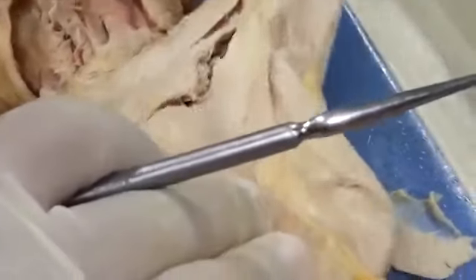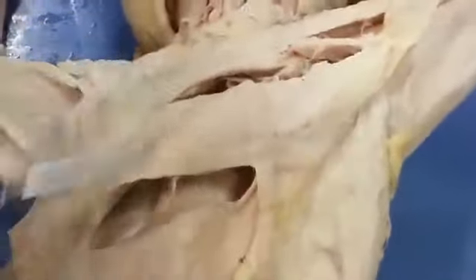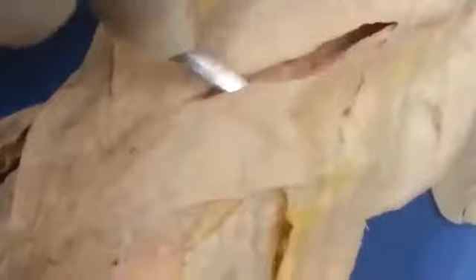As we move down to the chest, the next group of muscles are going to be the muscles of the superficial chest. In this case, we have our landmark cat muscle only, the pectoantebrachialis. As we go deep to that one, you're going to see the pectoralis major and then the pectoralis minor. And then again, just for identification and landmark purposes, the xiphihumeralis on the cat.